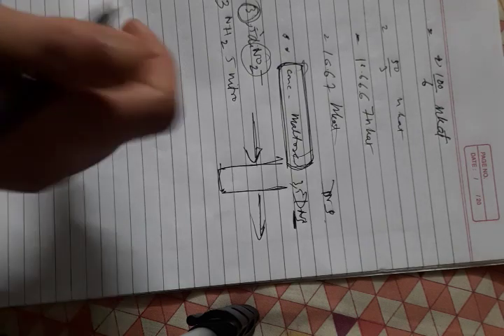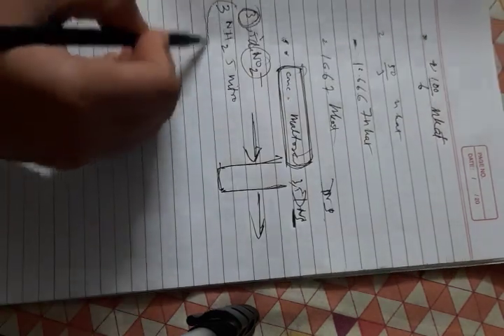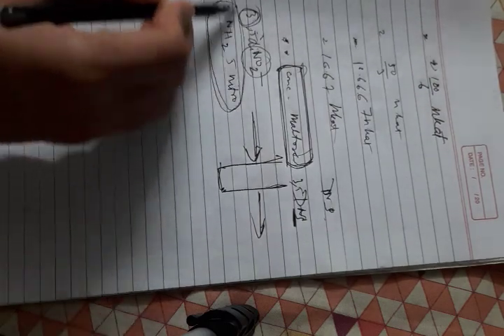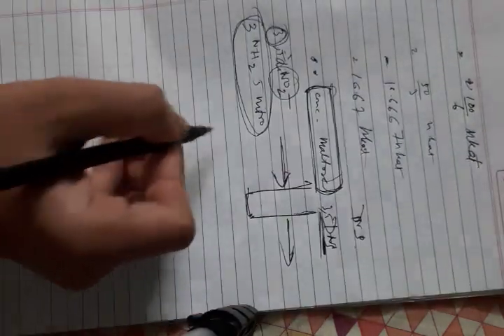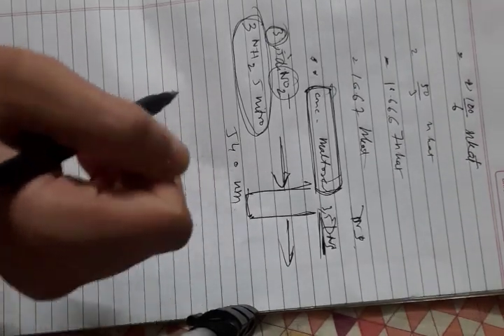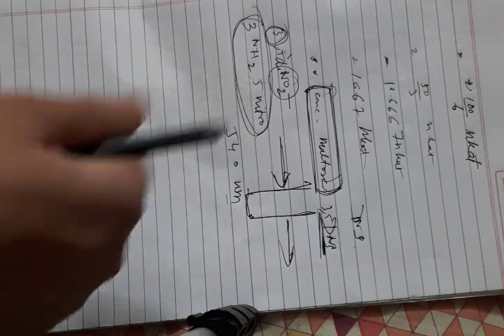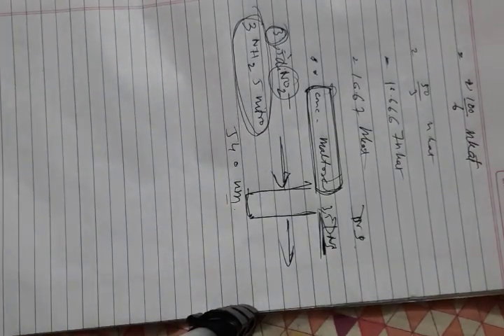It has a deep red, quite orange color, and its maximum absorbance is at 540 nanometers, and that's it.